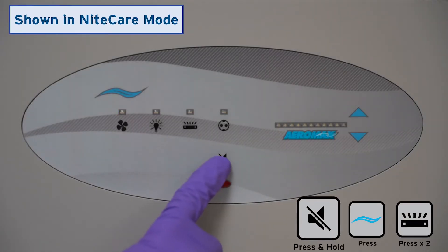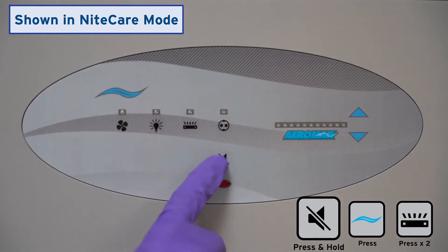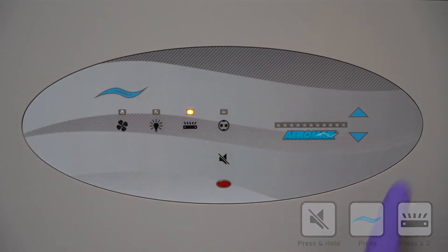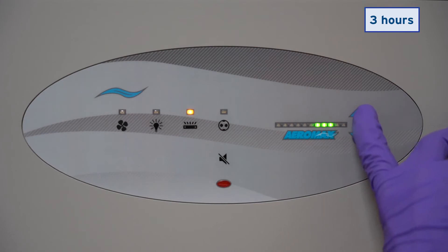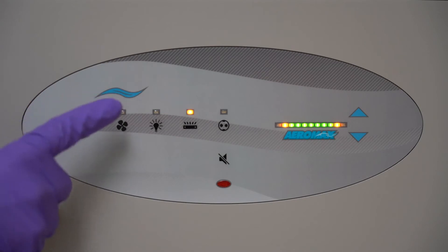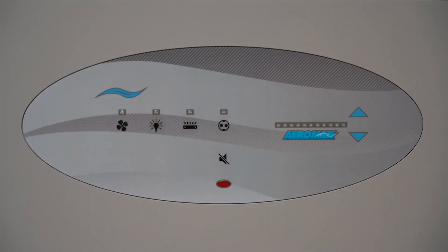First, enter the UV timer menu using the key sequence shown. A blinking light means you're in. Use the arrow keys to increase or decrease the time the UV should remain on. Press the WAVE key to accept the time or the silence key to abort.